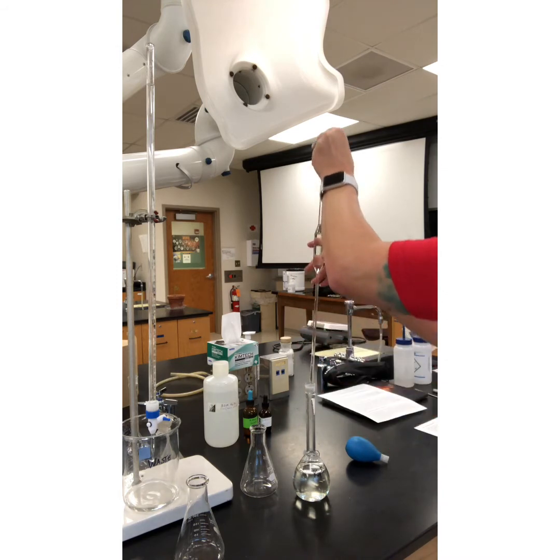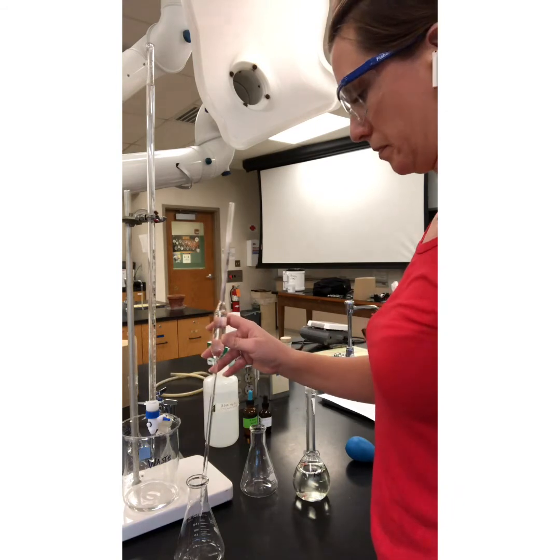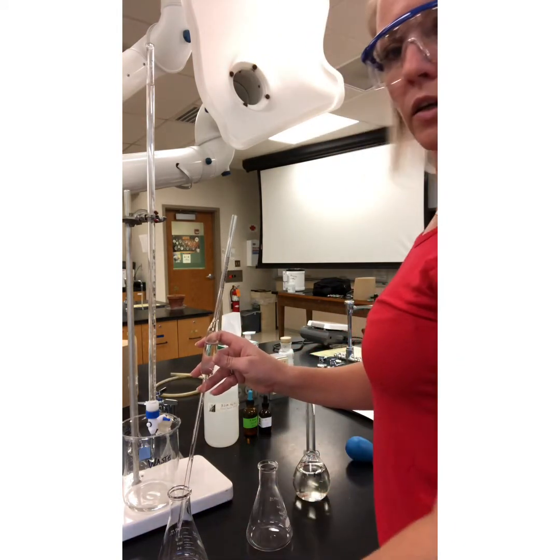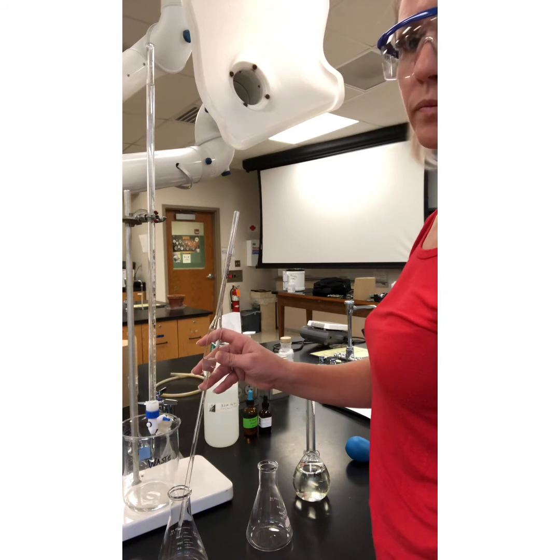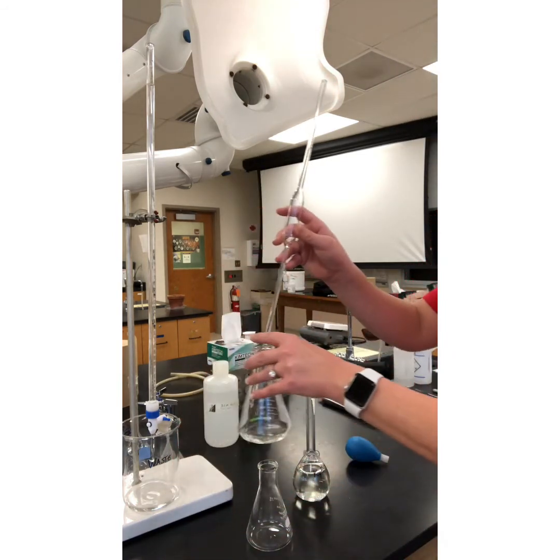I have exactly 25 milliliters. Release the pressure. Let it draw out into my sample container. Can't see what I'm doing. There we go.